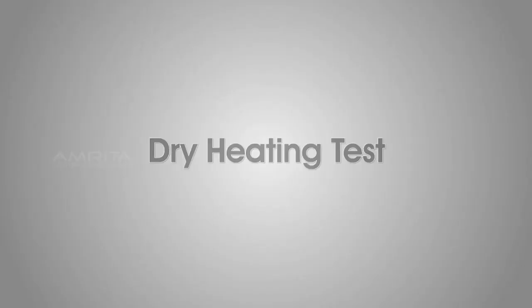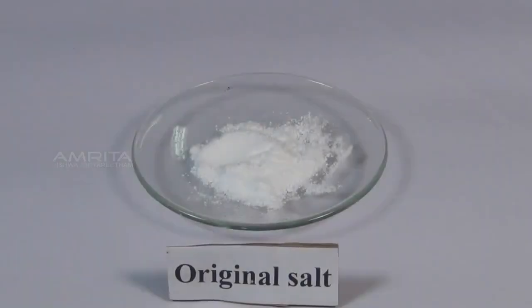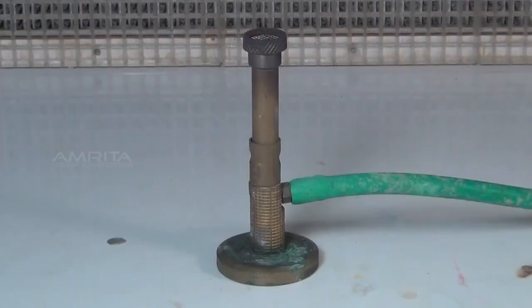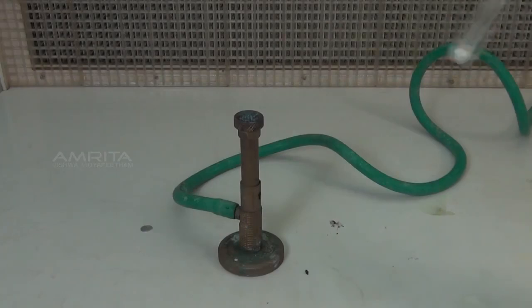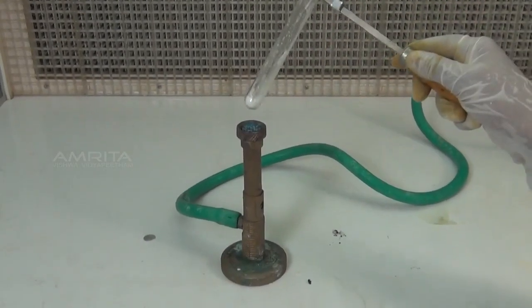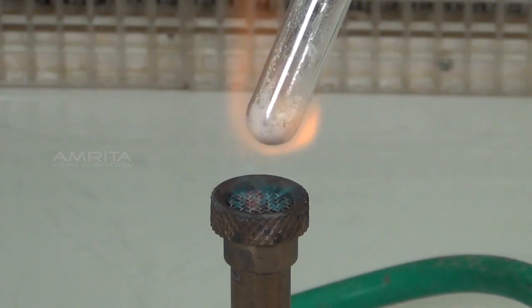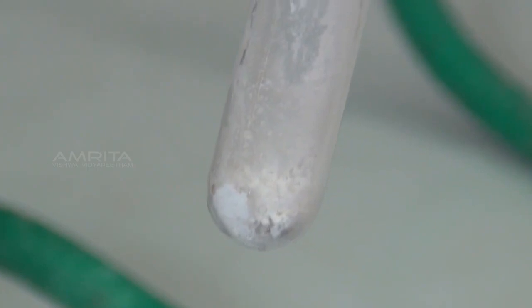Dry heating test. Materials required: original salt, test tube holder, and Bunsen burner. Procedure: take a small quantity of the salt in a test tube and heat it over the Bunsen burner. The salt swells up into voluminous mass indicating the presence of phosphate.